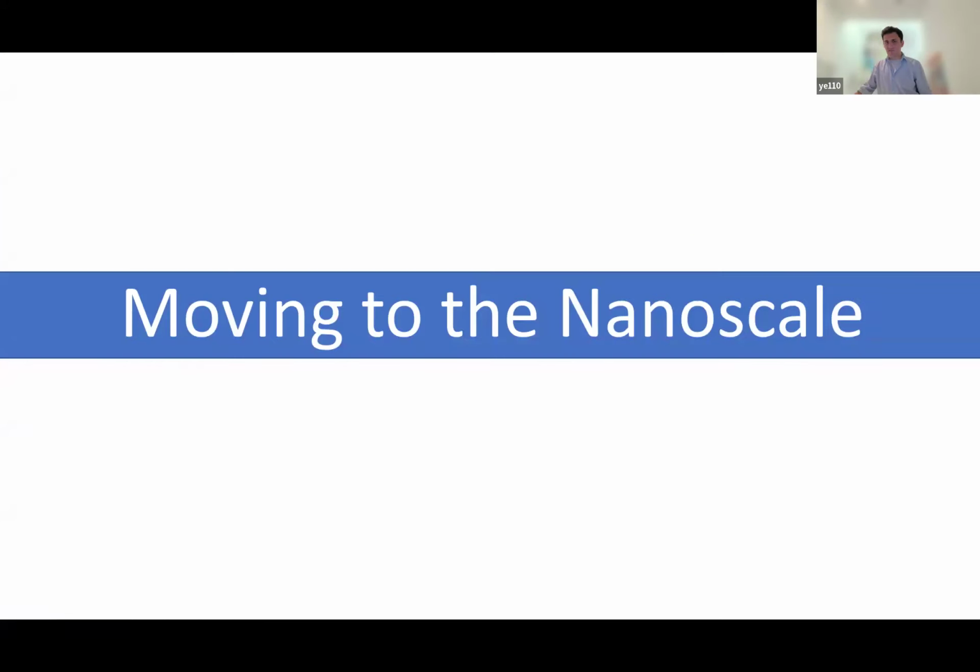Okay, so the final part of my talk is, how do you move towards the nanoscale? Most of our synthetic cells are the size of a bacterium or a mammalian cell, maybe 5 microns or bigger. But for many applications, you want to go nano. Think about therapeutics. In traditional drug delivery, they say you need to have lipid nanoparticles and liposomes, which are maybe 200 nanometers, for them to penetrate deep inside tumors, to navigate through the capillaries, to get through the blood-brain barrier, and so on. So it's a big challenge.